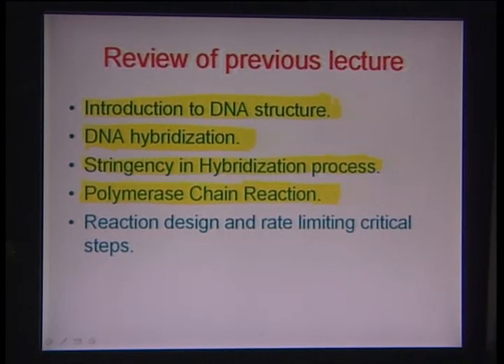It is one of the breakthrough technologies of this decade, which has essentially been the foundation of the huge molecular diagnostic industry. We also talked about how to design certain steps of this reaction, and where the reaction can be rate limiting, or which step of the reaction could be critical to limiting the rate of the reaction.